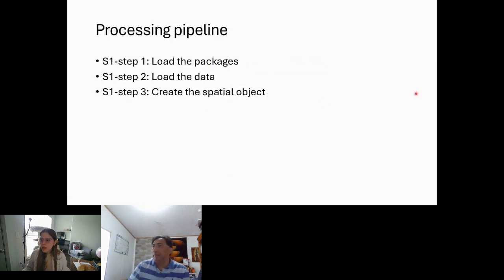Okay. So before we start, were you able to install the environment? Or do you have any questions on that part? We can start.